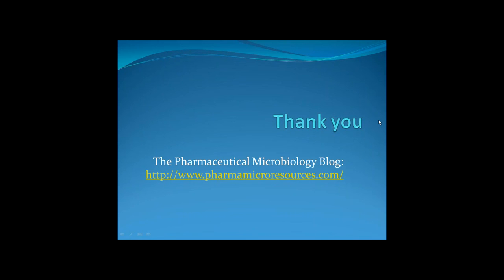Let's get another question here about wet contact times. So saying here in the efficacy test, the disinfectant is not re-wetted, so the validated contact time may encounter differences in drying. And how does this work in practice? And that's again a tricky one. It's true that the efficacy tests don't require re-wetting, but it depends sometimes on how remote the efficacy tests are from practical situations, and whether you're using the efficacy test to orientate what you do in practice, or whether you're happy for them to be separate.